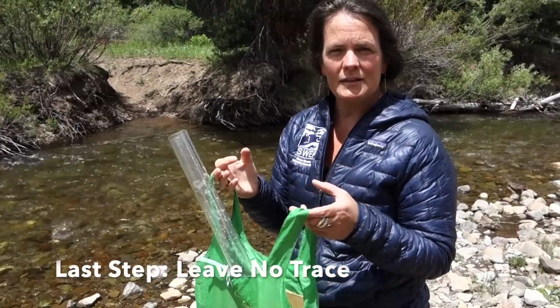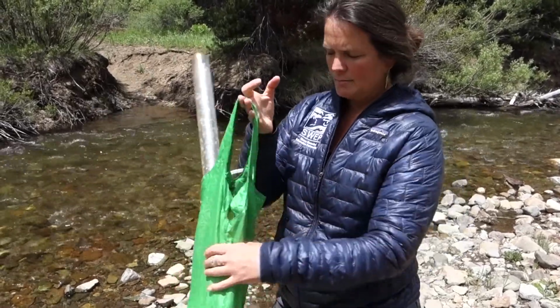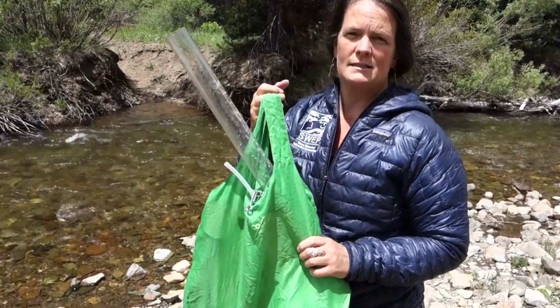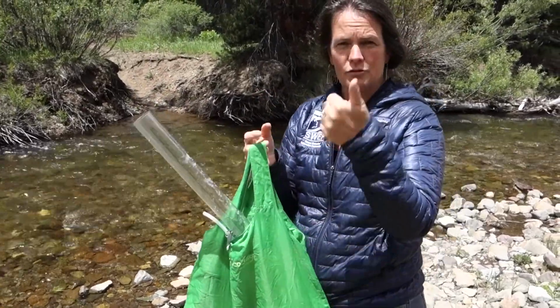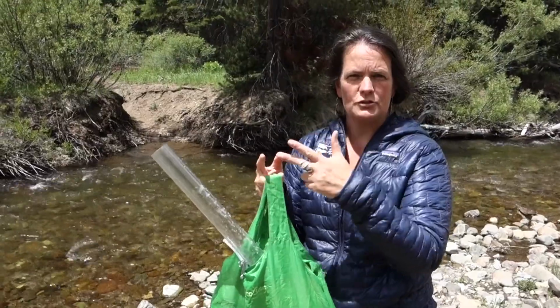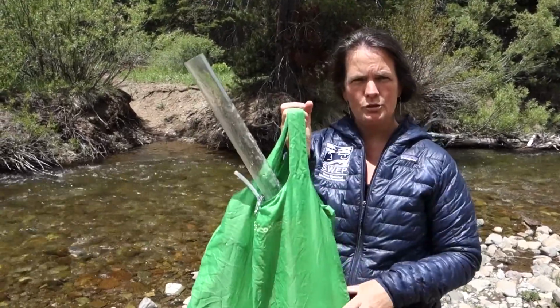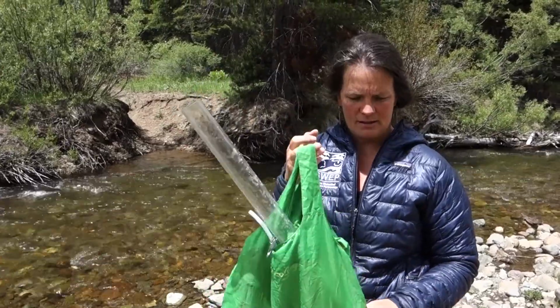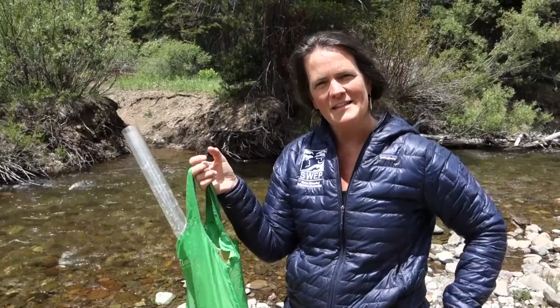So before leaving the creek, please make sure that you do an inventory check. Make sure all of your equipment is collected back into your bag before leaving the creek. So you want to make sure you have your thermometer, your pH strips, your dissolved oxygen kit, as well as the turbidity tube and the data sheets. Everything's collected. You've left no trace, and then you can bring all that stuff back to me.